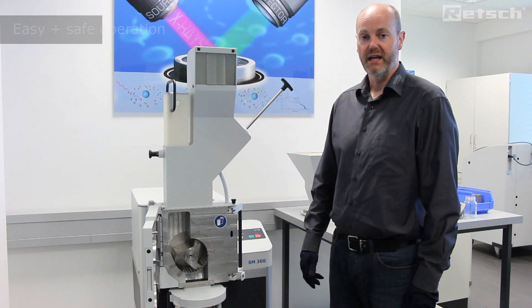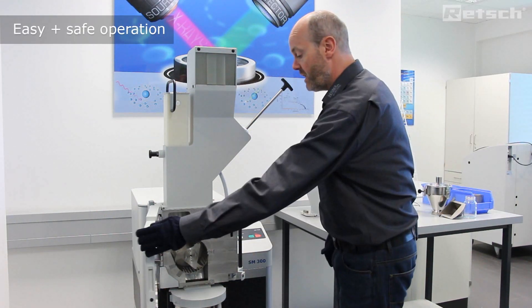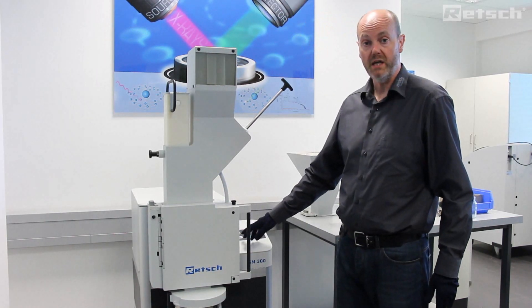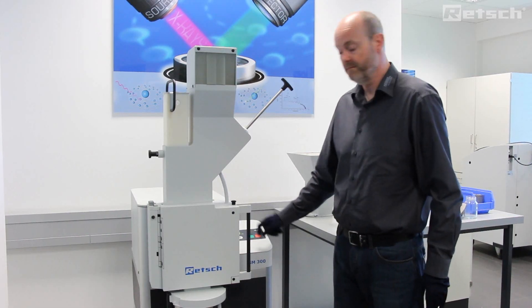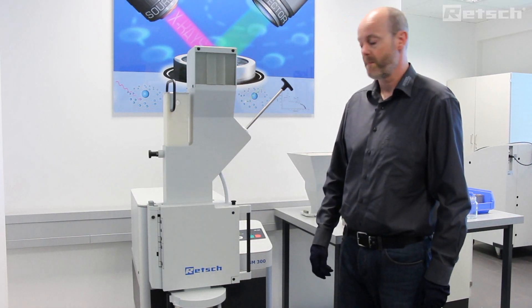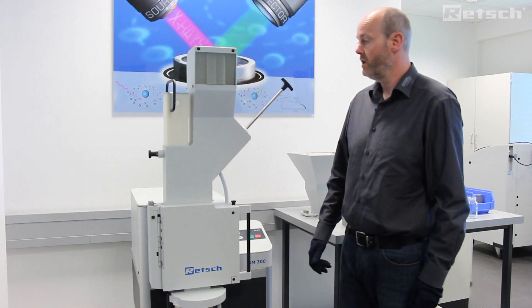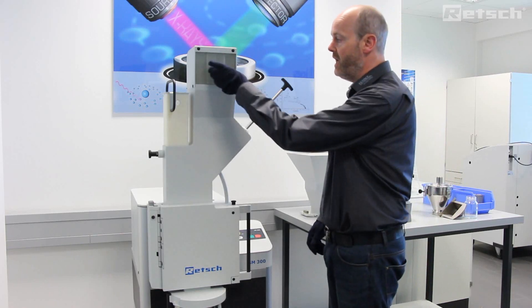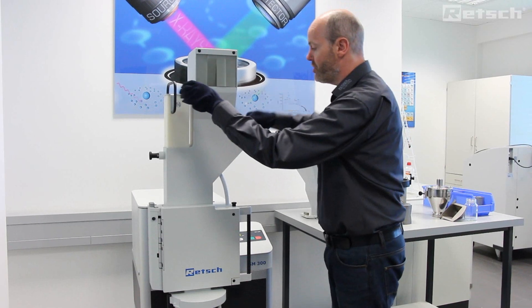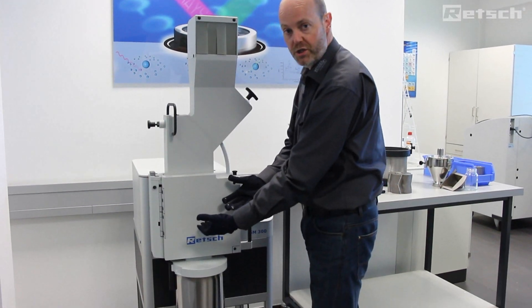The SM300 is very straightforward to operate. We simply close the door, set the required speed and press the start button. Once it's reached the preset speed, we simply take the sample material, feed it in through the top of the feed hopper and use the dual plunger system to plunge the material down into the crushing chamber.